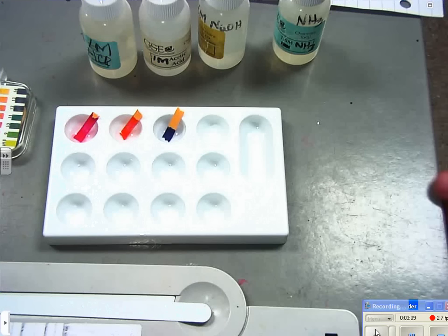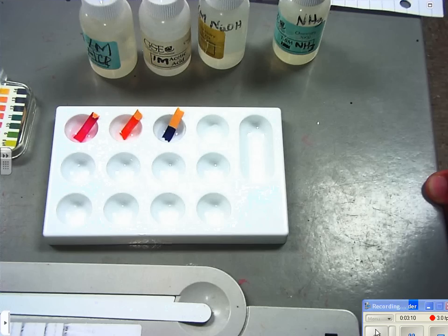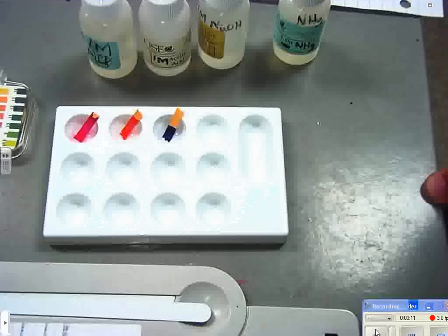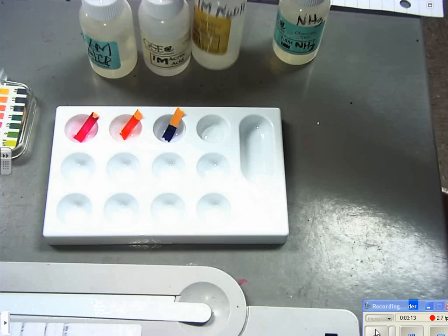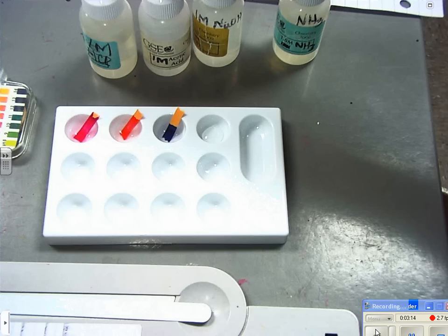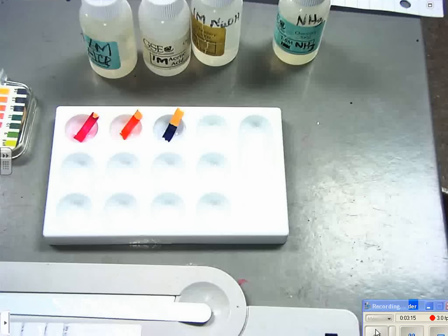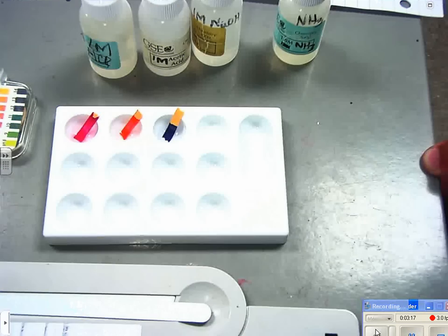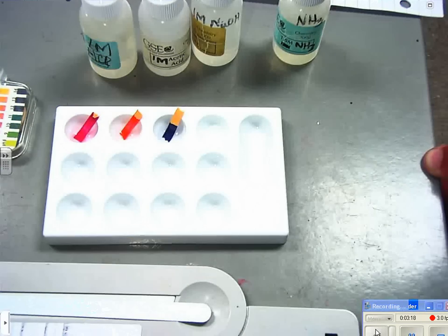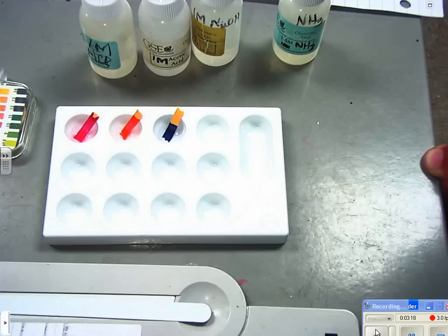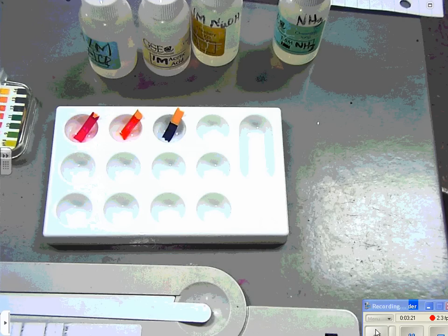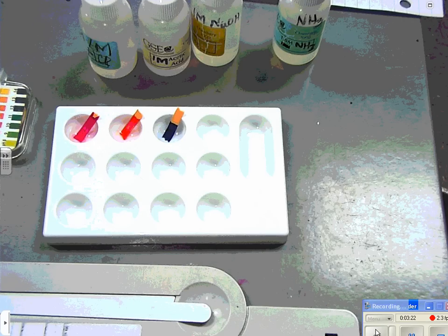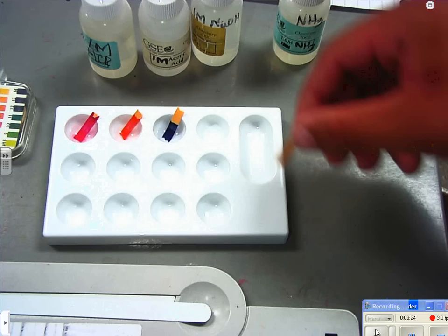Wow, that one got some color didn't it! The pH of sodium hydroxide is 14. That's right up there at the top of the scale isn't it?